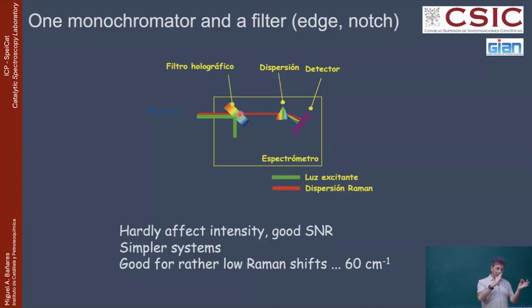So this is a mirror to all of them. But if some photon is coming back and the wavelength is different, are you 514? It says, no, I have a longer wavelength. Okay, then you may go. So it's like a magic mirror. So anything that is not the laser will go through. So something as simple as that will reject the laser within experimental error, and only Raman photons will go into the prism and into the detector.